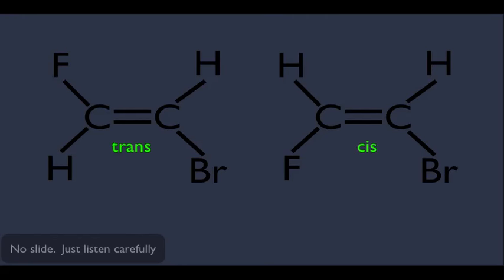Remember, in organic chemistry, these are two different molecules. If we wanted to use the H NMR to distinguish these molecules, watch what happens. We might run into a difficult problem here. And let me show you what I mean by that.